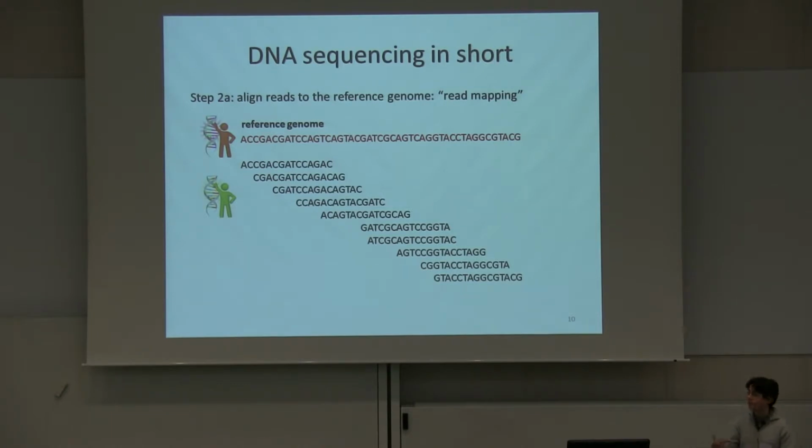They are systematic, they are biased, and it takes quite a lot of domain knowledge to know how to deal with these errors. There are certain tools that do this, apparently over 100 or even more, but I think that I can safely say that BWA is one of the most important tools for doing exactly this, namely aligning reads to a reference genome, especially for DNA. So most of the people are actually using BWA.